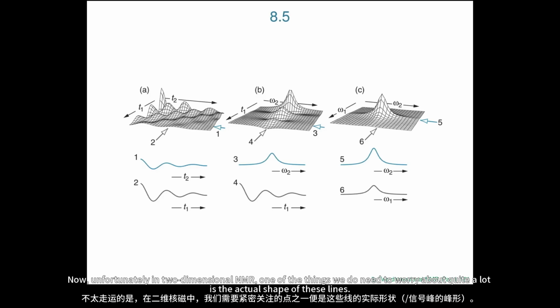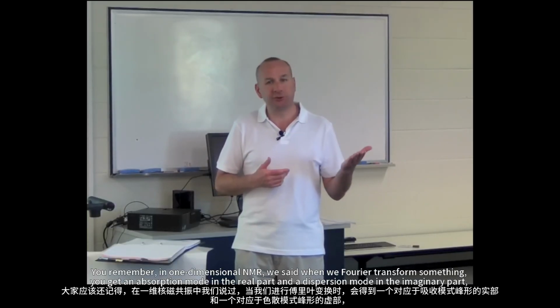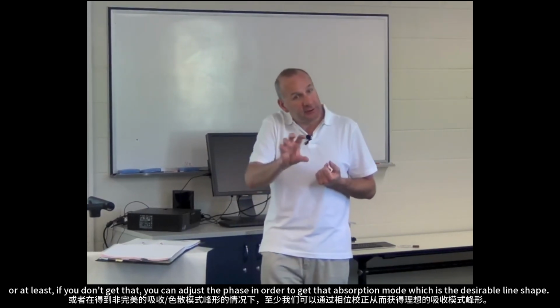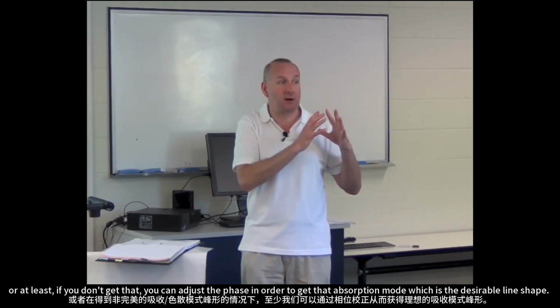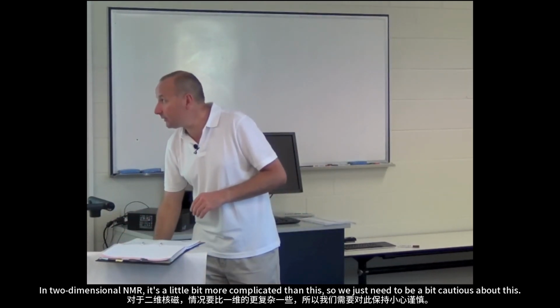Now, unfortunately, in two-dimensional NMR, one of the things we do need to worry about quite a lot is the actual shape of these lines. You remember in one-dimensional NMR, when we Fourier transform something, you get an absorption mode in the real part and a dispersion mode in the imaginary part. Or at least if you don't get that, you can adjust the phase in order to get that absorption mode, which is the desirable line shape. In two-dimensional NMR, it's a little bit more complicated than this, so we just need to be a bit cautious about this.